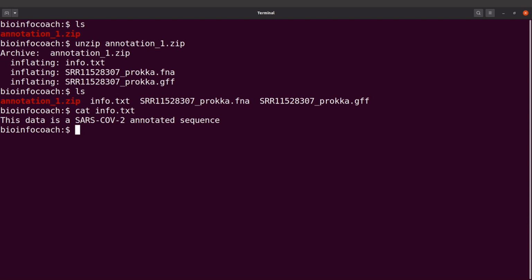So now that we have our data, we can proceed. Let's call jbrowse again. So we will say jbrowse, and then we will execute it.